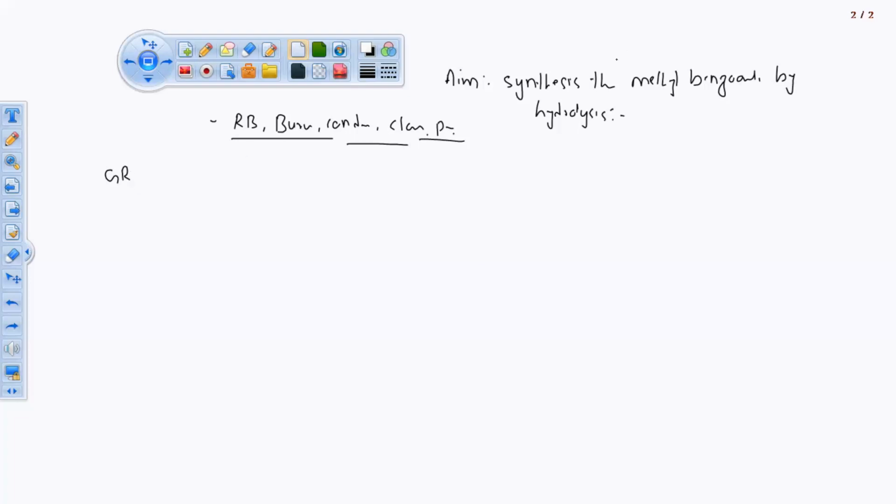What is there in the synthesis of methyl benzoate is we are having this reaction. With methyl benzoate we are going to get the benzoic acid. methyl benzoate से हमको मिलेगा benzoic acid. So that reaction we are going to follow in this condition.